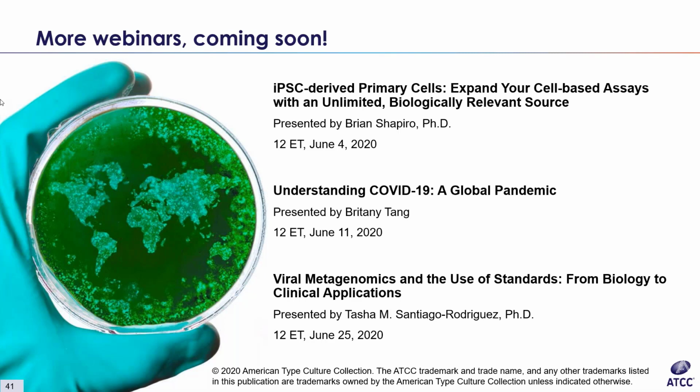All right, what else do we have? The facility is a BSL-2 level. So back to that previous question: in a BSL-2 facility, you need PPE as well as being sure the work is in a biosafety cabinet, laminar flow, and all of that. As long as you're cleaning everything like you should in between uses in the hood.